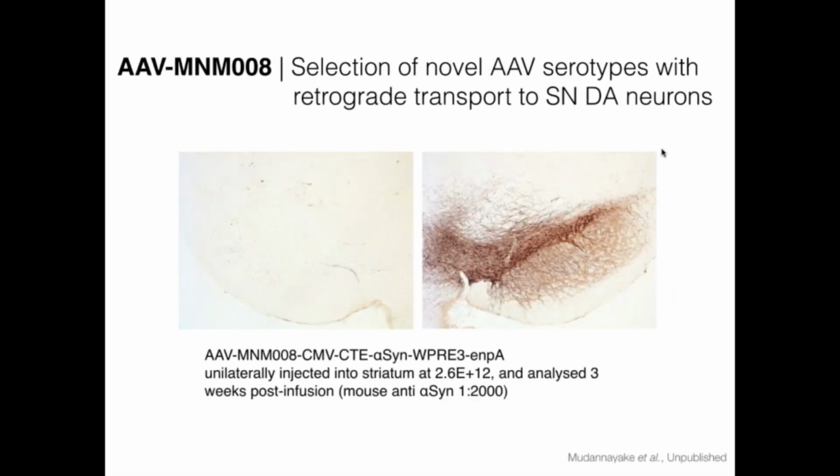That is a very interesting observation, that we can map protein functions by this approach. This is exemplified here with the flexed vector injected in the striatum, and we can see a highly transduced area to the right using M008, but basically no transduction using AAV2.